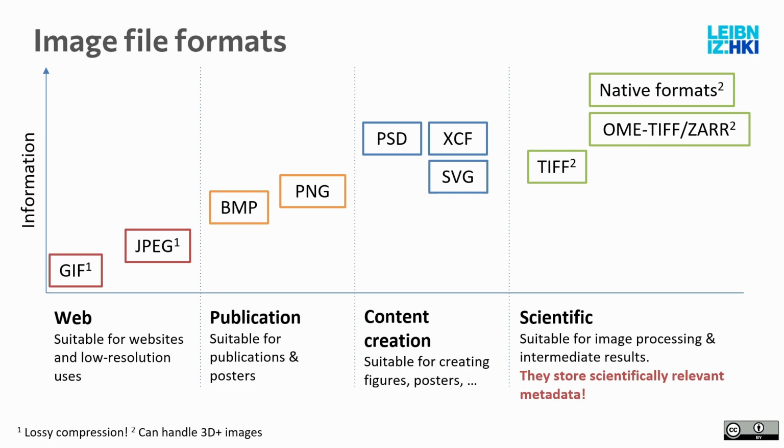I've received data now for your exercise, which you will hopefully be looking forward to, where I did not know the channels, but I could look this information up because it's stored in a native file format. And it says, okay, this channel is this dye. And then other things, the physical size of each pixel, so how many microns a pixel is actually in real world coordinates.